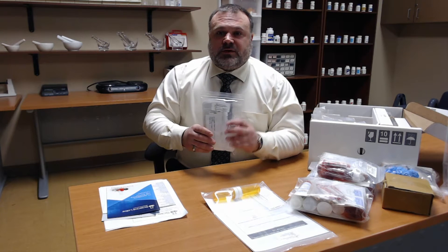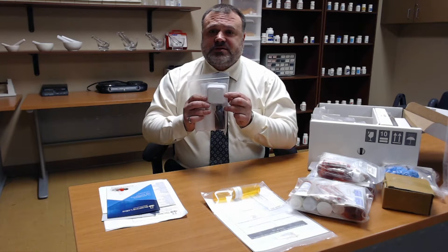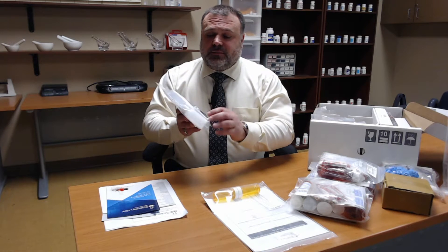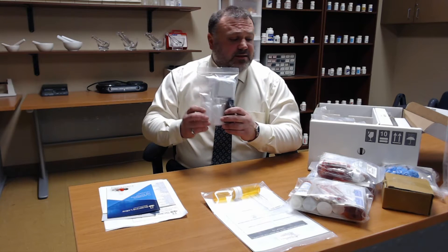Here is your liquid and emulsions kit. We have measuring boats for when you're utilizing the digital scale that does come along with the kit. We have other vials for making your creams and ointments and dispensing them.